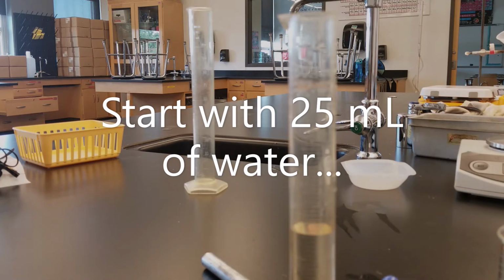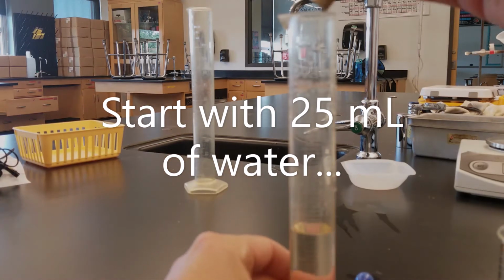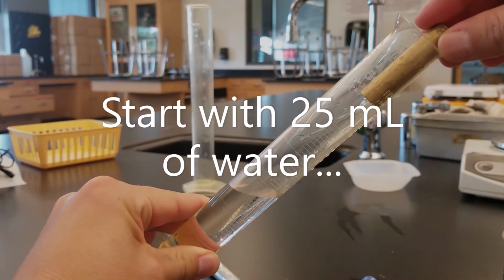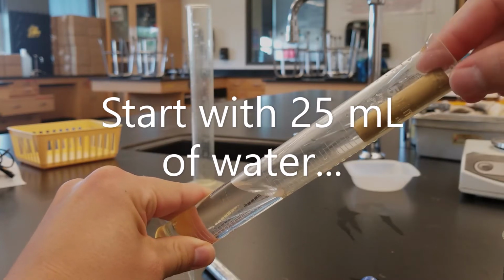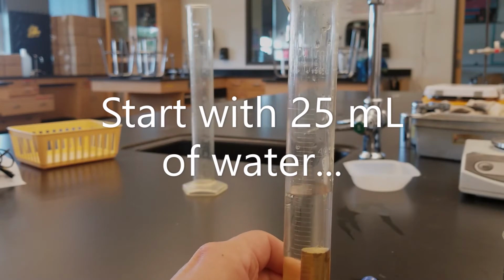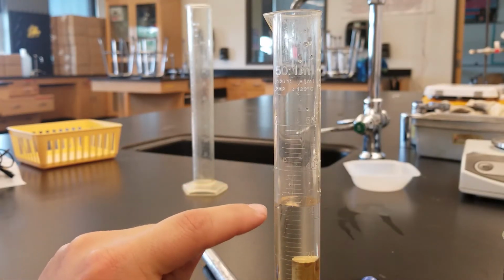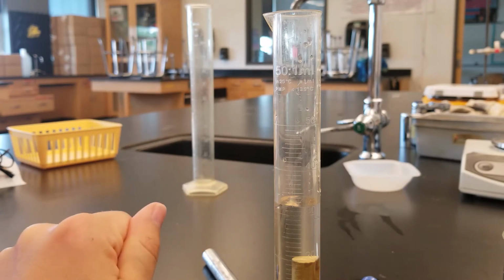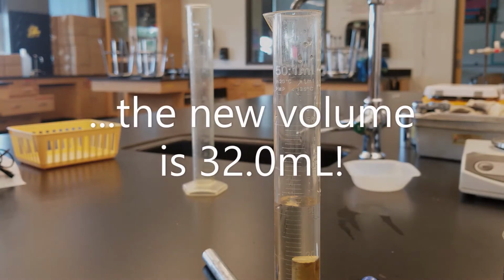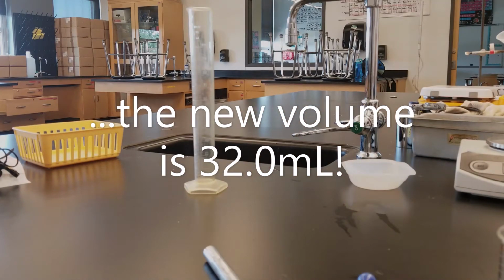When we put the first object in, we are looking to see how much the water will rise. So tilt your graduated cylinder at a 45-degree angle and slowly slide the object down in. We don't want to splash out the water. We then read the new meniscus and record. And then you can dump out the water into the sink and remove the object.